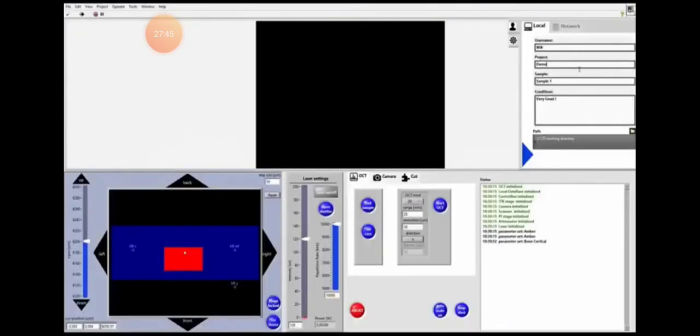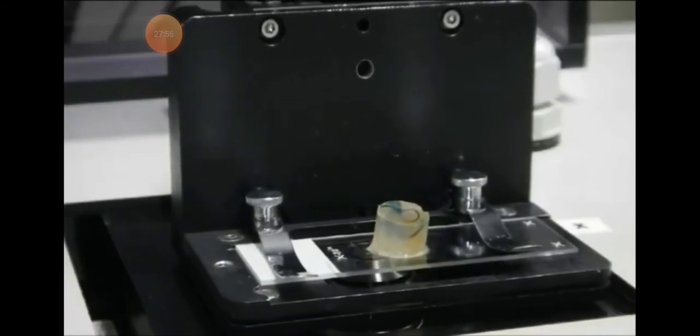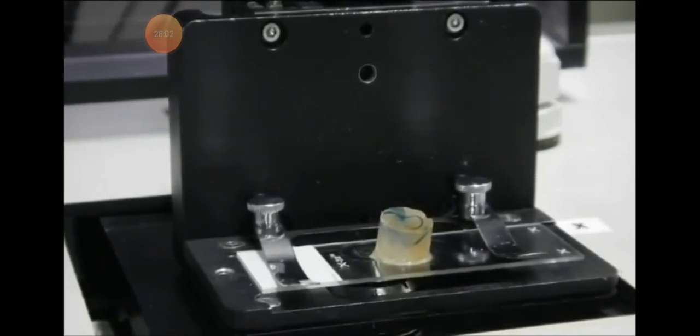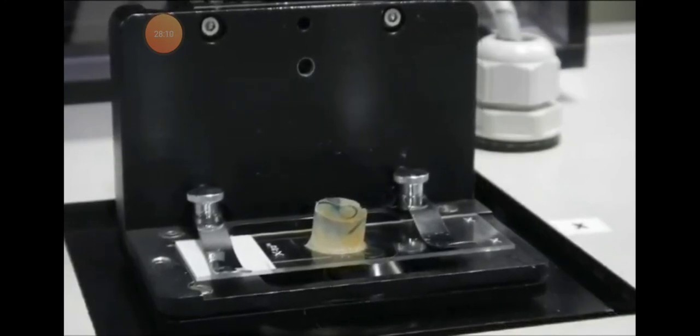After the entry of a few software settings, the cutting process has begun with a push of the start button. The cutting process will now be completed automatically, with the cutting time for a sample of the size depicted being approximately 3 minutes. This time may be used for the preparation of the next cut, the documentation of samples, or the setting out of histological stains. After the cutting process has been completed, the sample may be removed from the microtome.